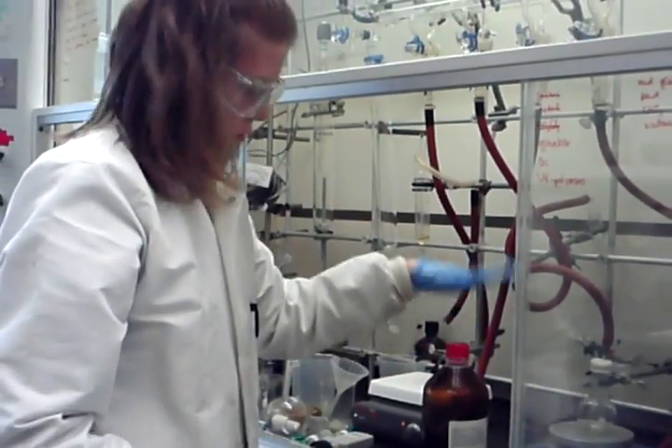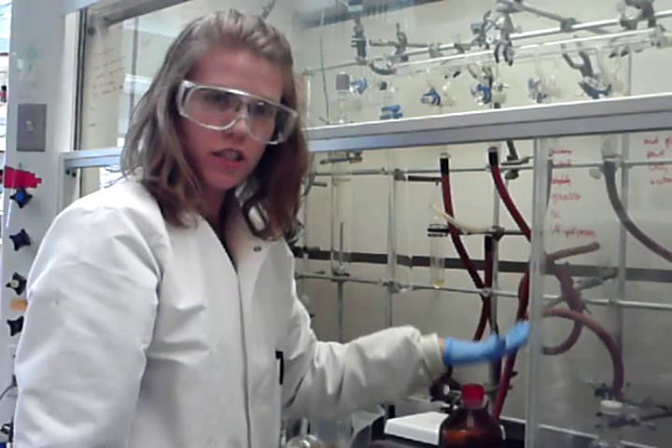Simply pack it and store it back in the fridge. You want to store these air-sensitive reagents in the fridge and not the freezer. Ensure that you still get a good metal black seal. Hope that helps.